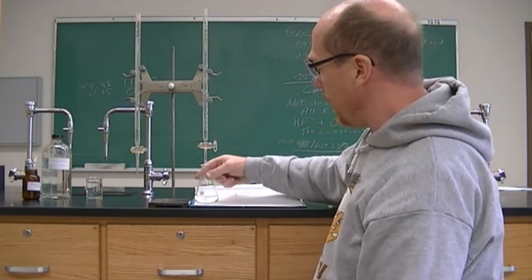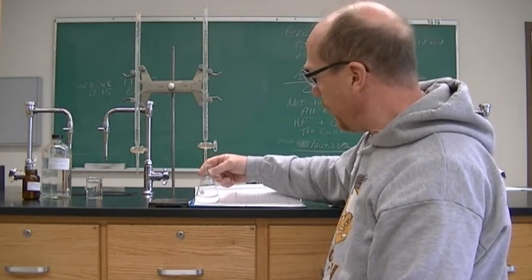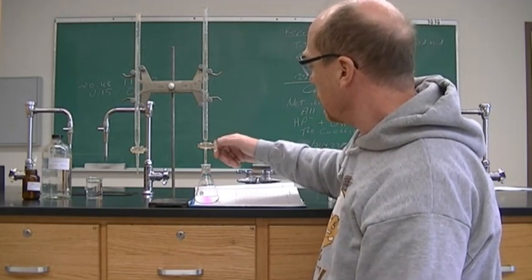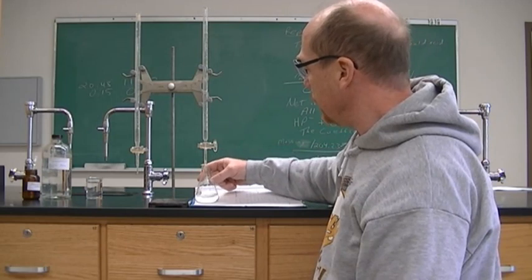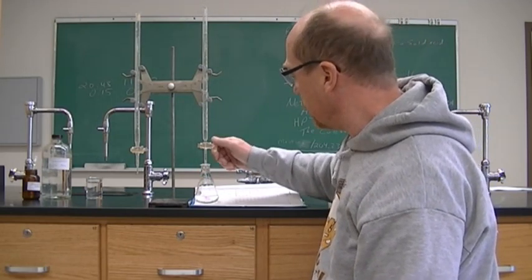So I have added the NaOH. I don't know if you can see it on the film, but there is some pink as soon as it hits. All right. And again, it has to stay pink for 30 seconds while swirling the flask.